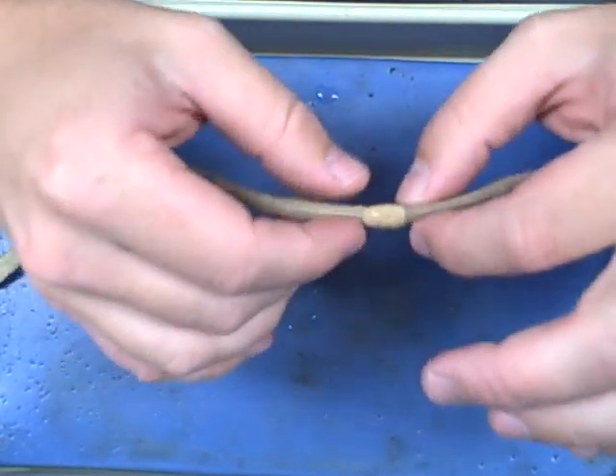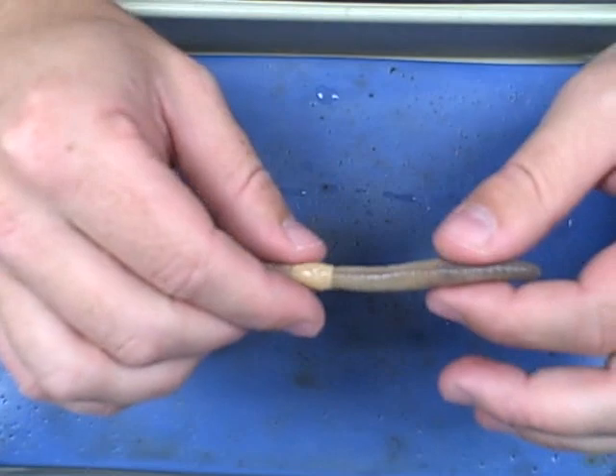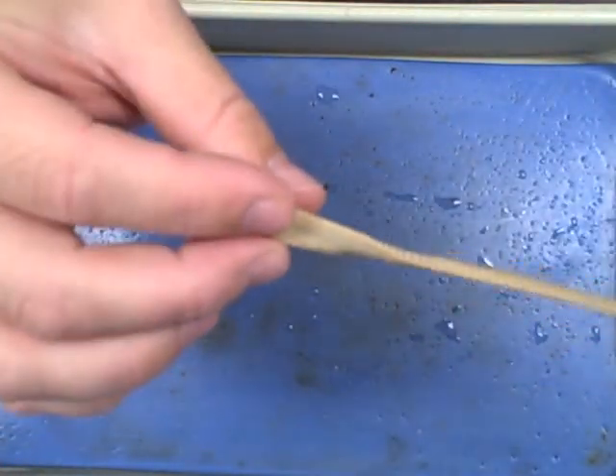The anterior can be found by locating the clitellum right here. It looks kind of like a band-aid almost wrapped around the worm. This shorter piece is then the anterior. The posterior then is the opposite side.